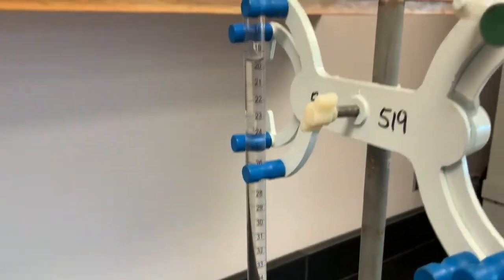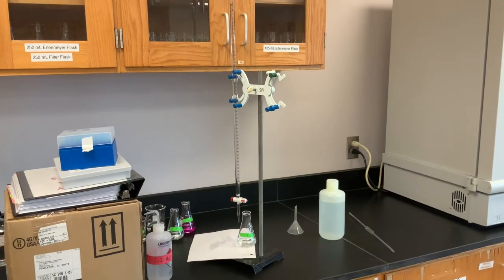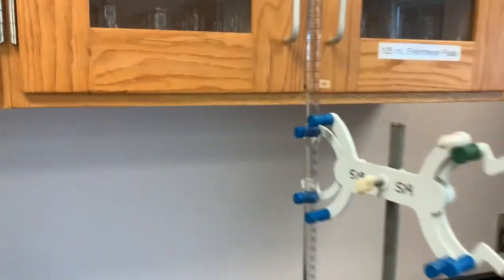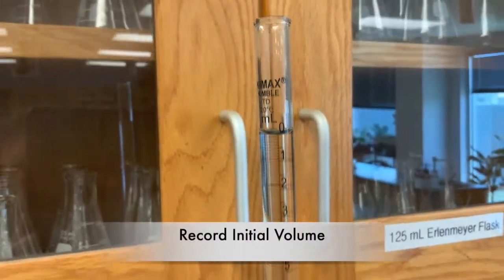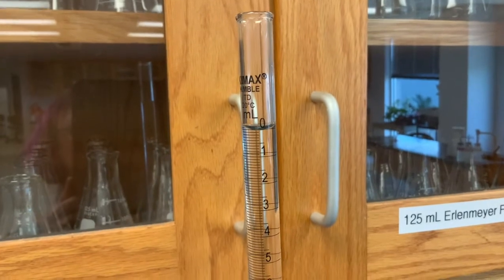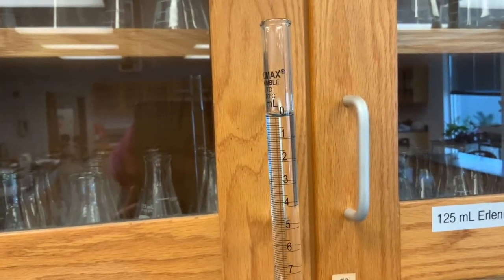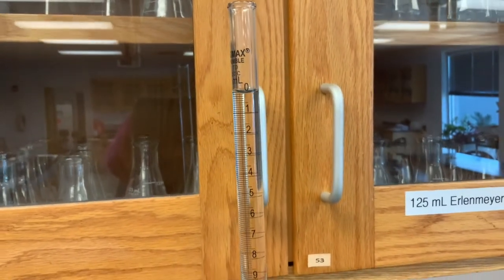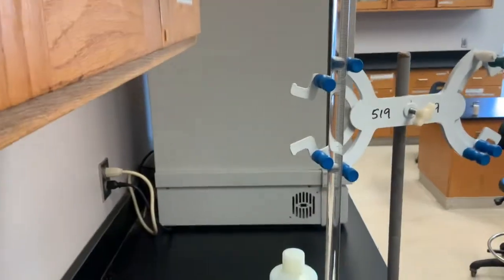And then we're going to go ahead and set up for trial three. So we're ready for trial three now. We've got our burette set up again. We have it filled up to the zero mark. Again, wanting to make sure that we record. Making sure we get eye level. We want to record that initial measurement. Again, just like with trial two, we're going to add very rapidly until we get to about 18 milliliters.